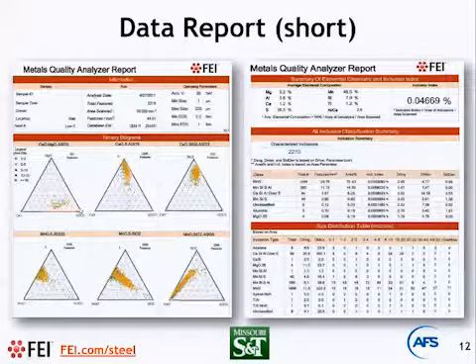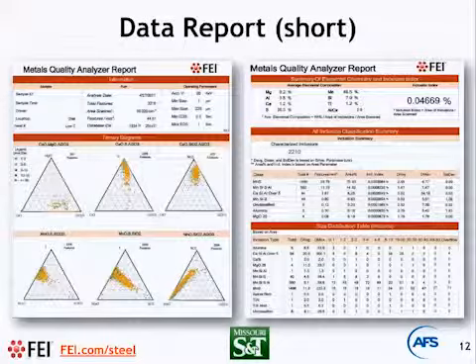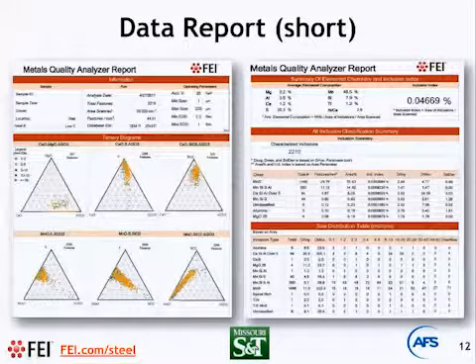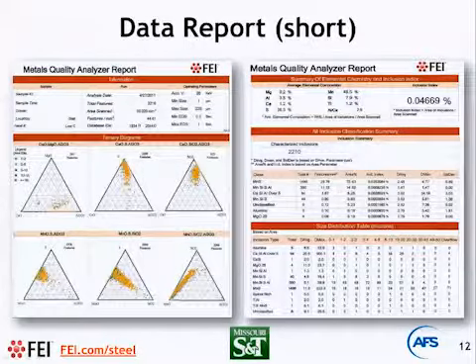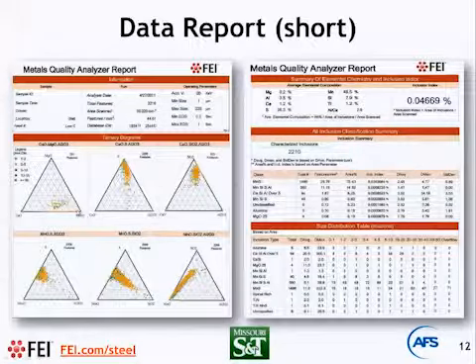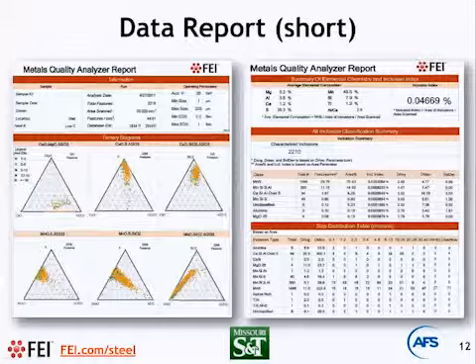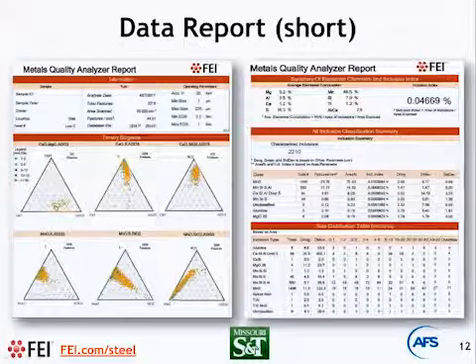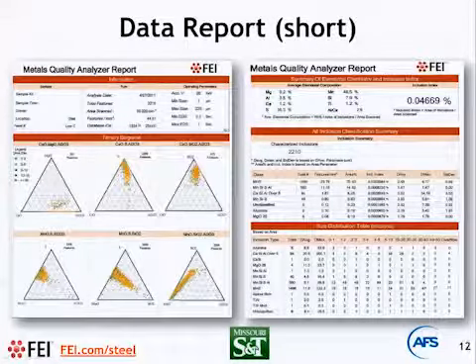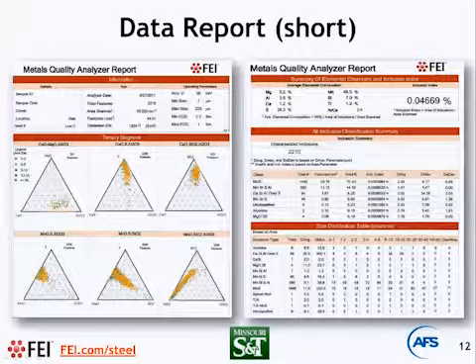And these ternaries really tell the statistical distribution. So for example, it may not just be pure aluminum oxide. So like the first diagram shows, as we measure inclusions, they could be a combination of calcium, aluminum, and magnesium. So by looking at ternary diagram distribution, it really provides insight information.